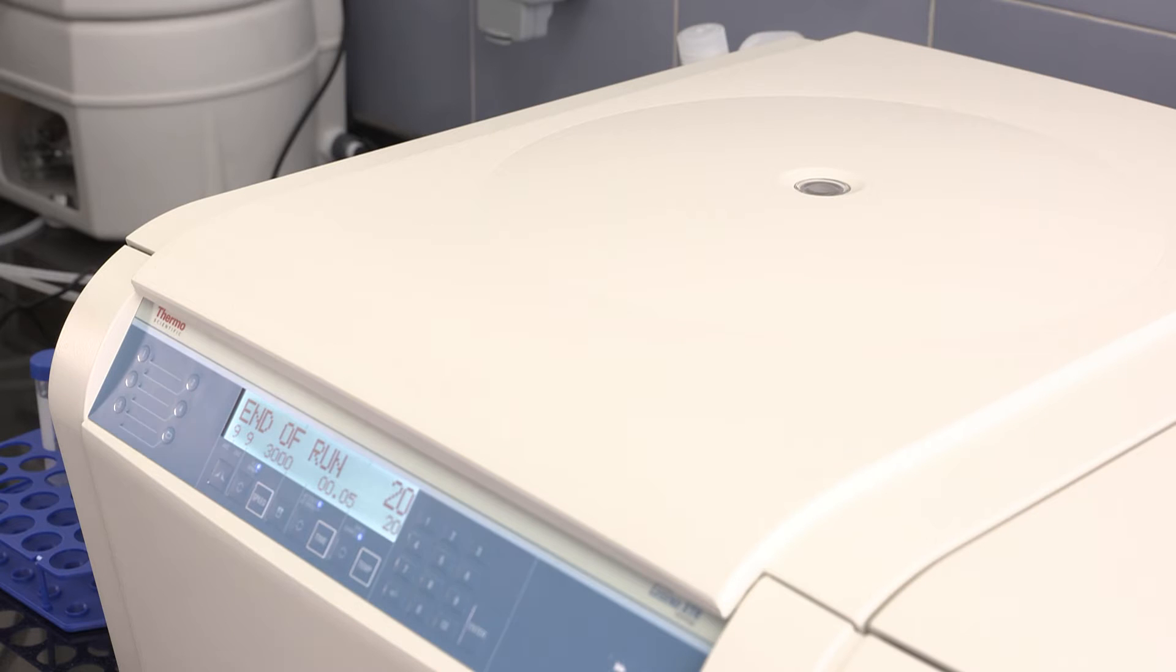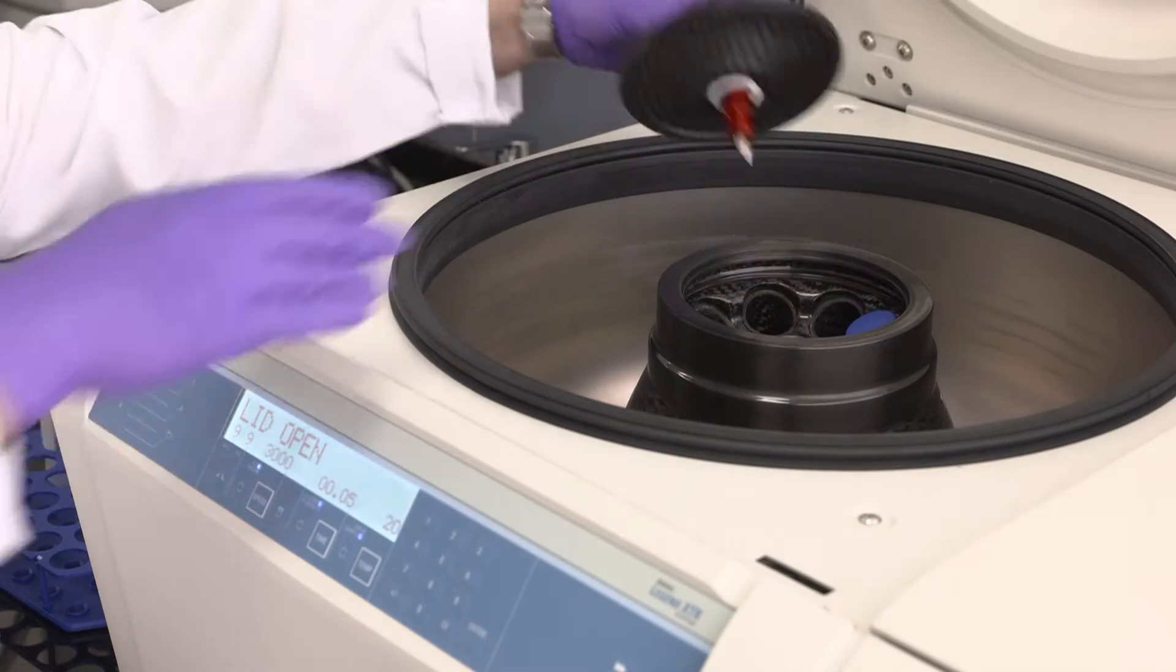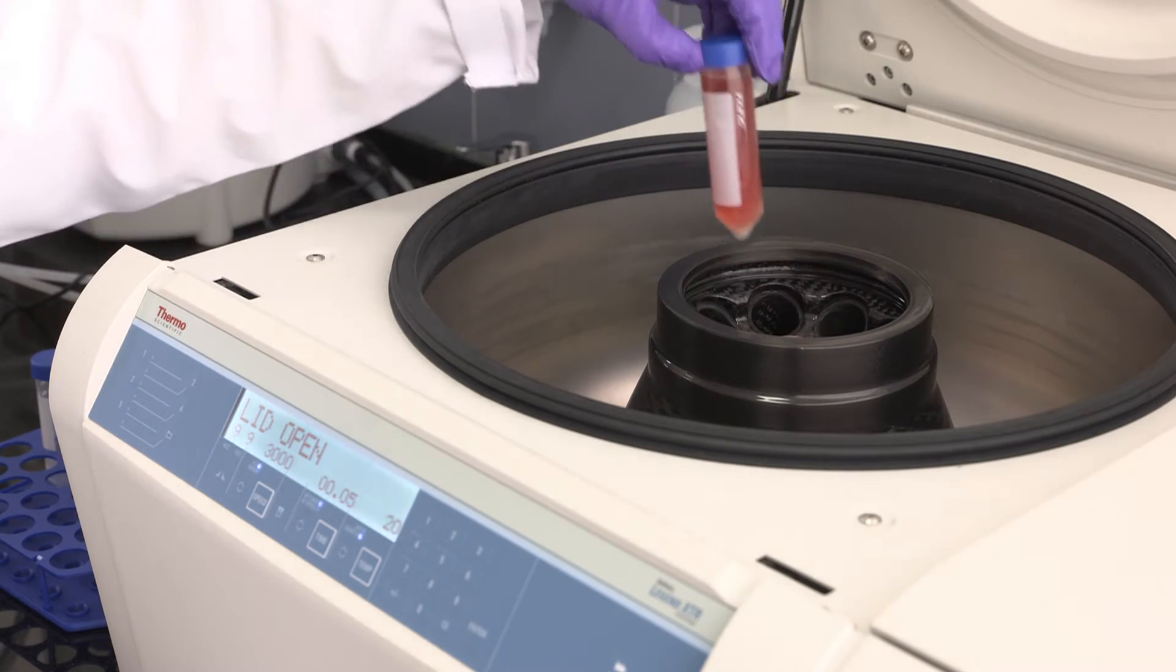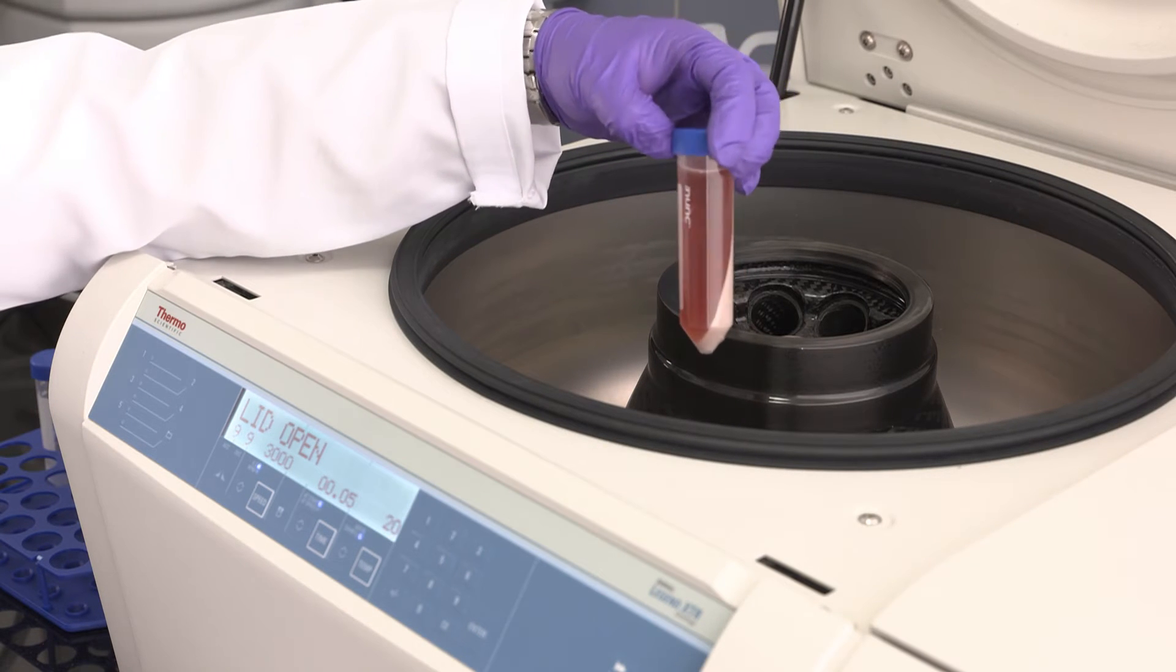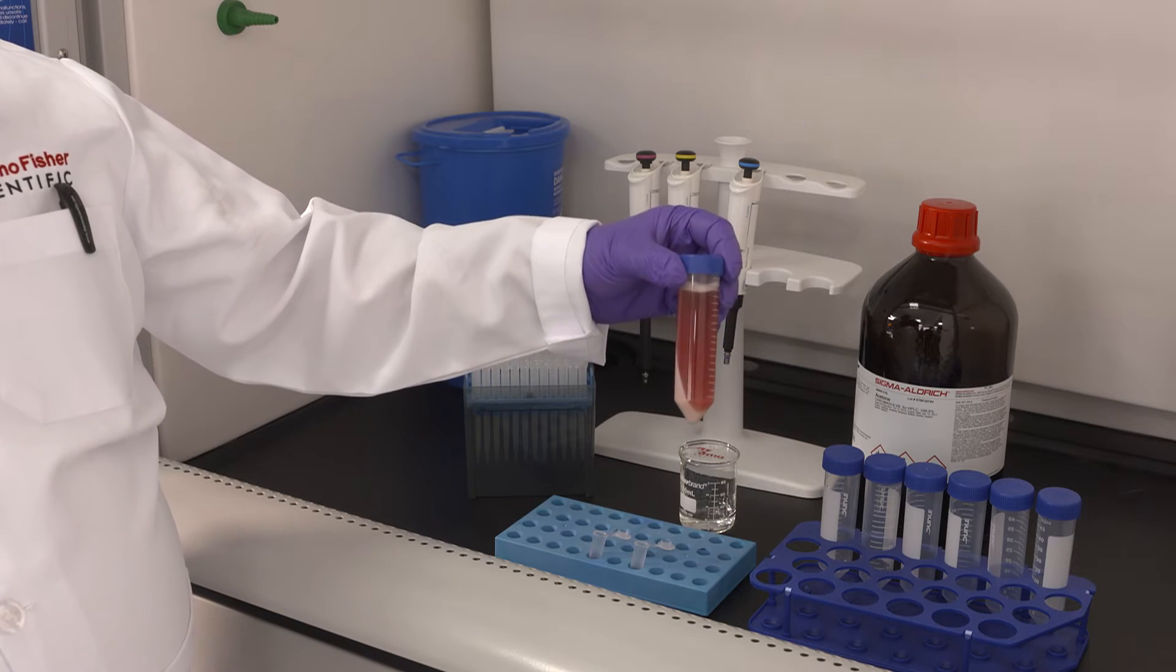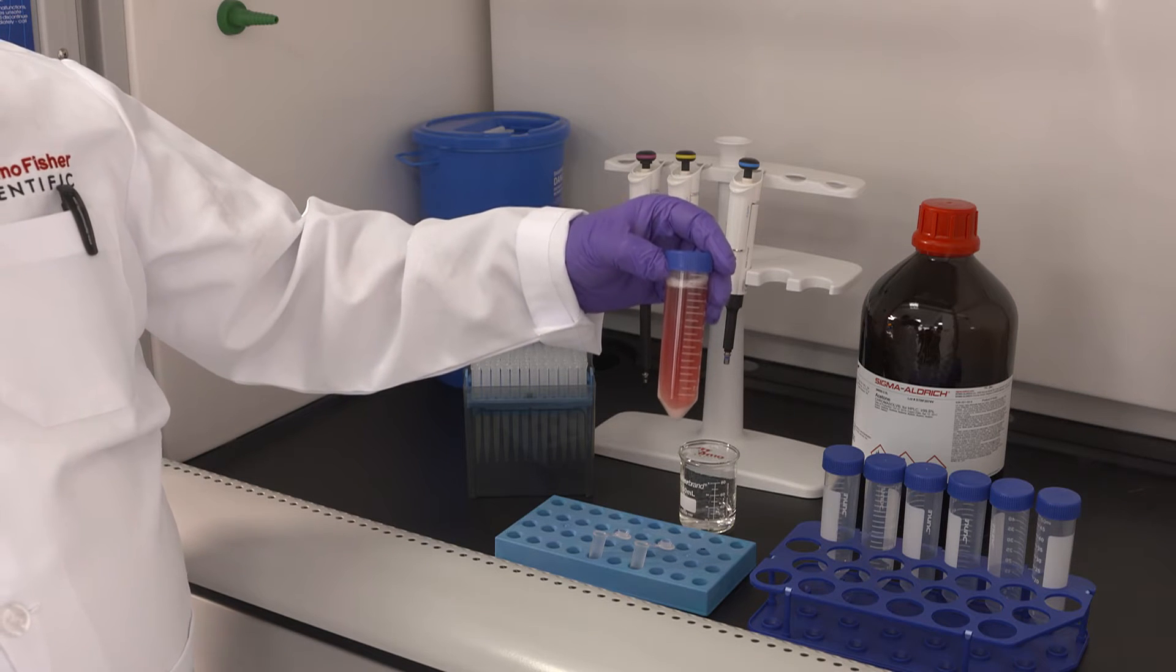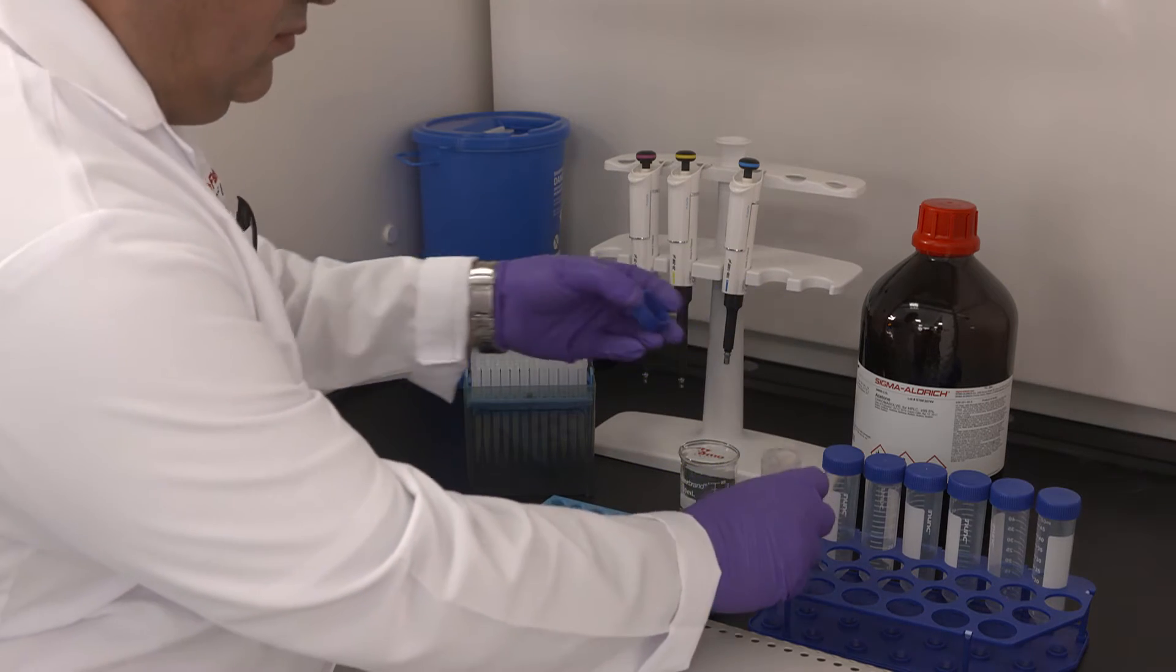The centrifuge is finished. We can see the debris on the side and at the bottom of the tube. Following the centrifugation, the debris are concentrated at the side and the bottom of the tube. At this point, we'll take 500 microliters of the supernatant and transfer it into a microcentrifuge tube.